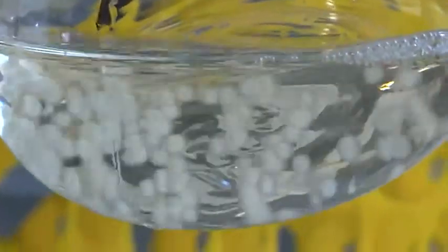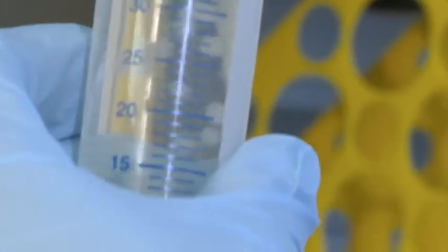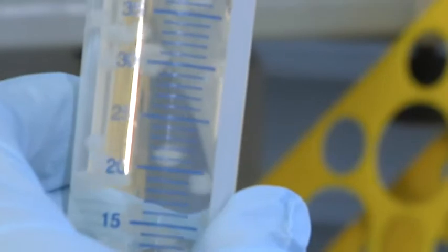The xylem liquid sample is put into a shaking flask where the fungus can grow. For comparative control, the fungus is transferred into a lab medium. In general, the fungus takes one to two weeks to grow.